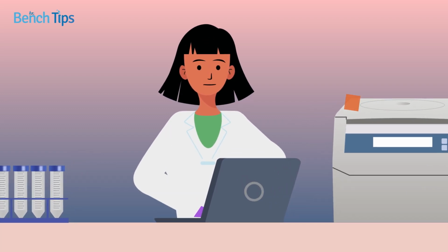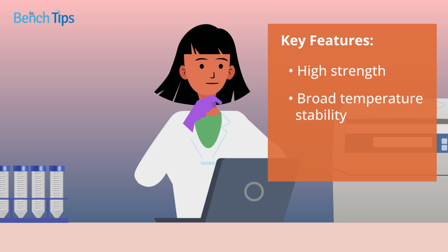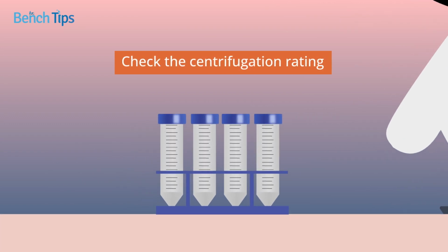When choosing centrifuge tubes for your lab, features to look for include high strength, broad temperature stability, and low protein binding. You'll also want to check the centrifugation rating and find out whether the tubes come in convenient reusable racks.